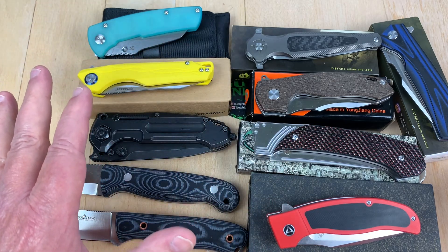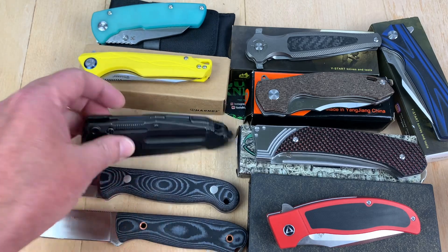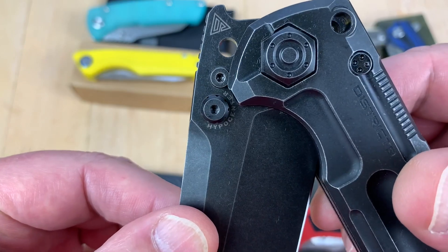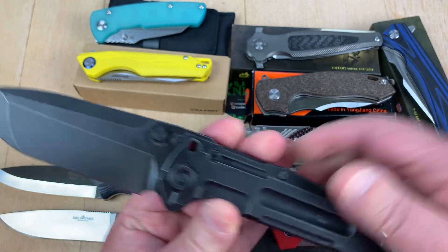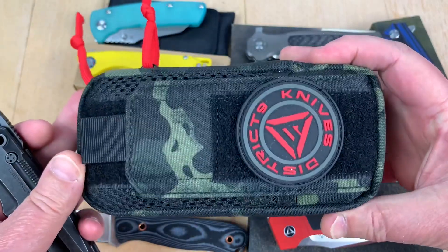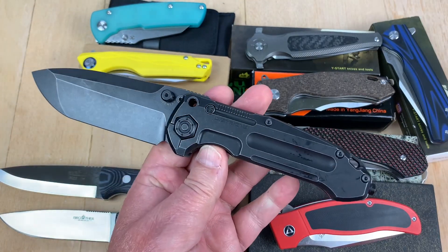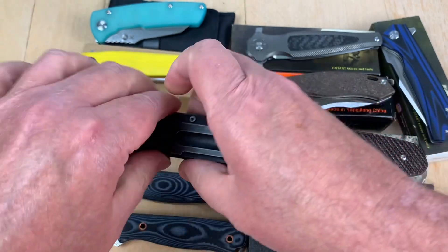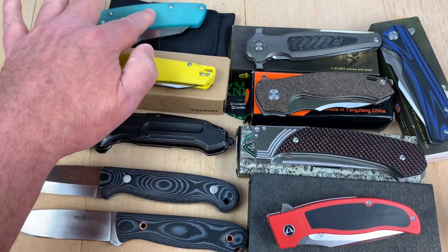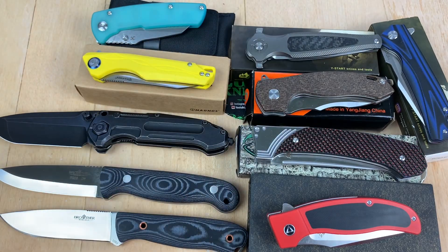It's an interesting bunch of knives — pretty crazy. We've got Brother Knives, the District 9 Hypo Center knife, Harnds, Kansept, QSP, Reptilian, Six Leaf, and Y-Start. Let's start with the Brother Knives.